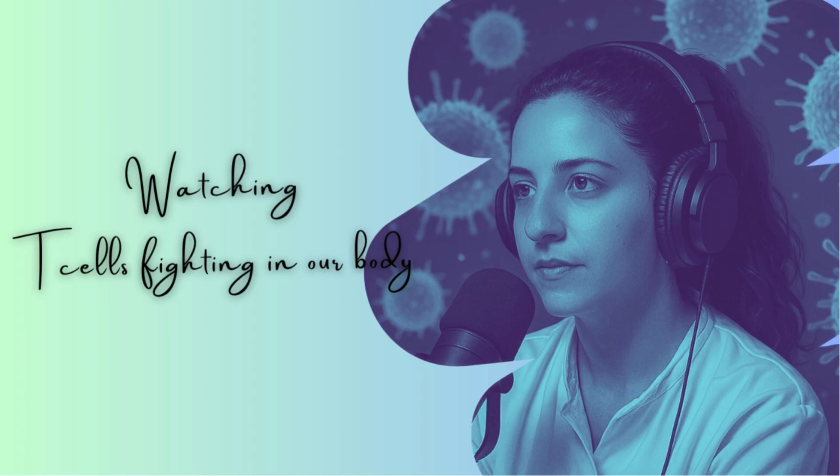And then we have when these cells are activated. How can we know that? Specifically by using CD69 and CD25. You can even go inside the cell using intracellular staining to detect cytokines like interferon gamma, IL-2, and TNF-alpha after stimulation, depending on what experiment you're doing and the question you want to answer, of course. That means that we don't just know who the T cells are, we also know what they are doing, which is really cool.